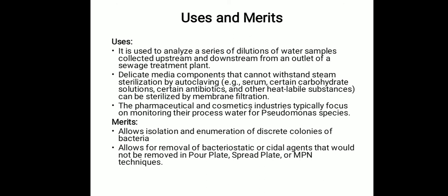It also allows removal of bacteriostatic and cidal agents that would not be removed in pour plate, spread plate or MPN techniques. It involves less preparation than many traditional methods and is one of a few methods that allow the isolation and enumeration of the microorganisms.